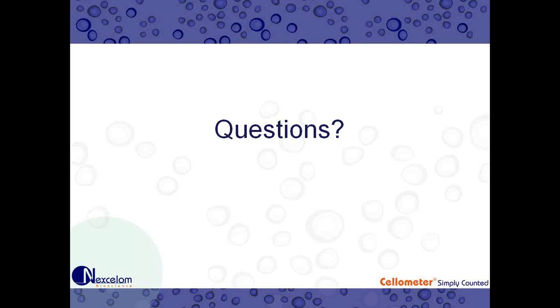So Stephanie answered that question very well, but I would like to add something more. If you're using a two-color assay, you must keep in mind that different fluorophores are excited in different planes. So a green and a red fluorophore would be slightly in different planes. If you're doing a two-color assay and you're focusing in bright field, there's going to be a natural offset, and you may see a slight halo effect. One of the ways you can look at it is to click Preview, and simply preview your image in the fluorescent channel to assure yourself that you don't have a halo, and adjust your focusing accordingly.